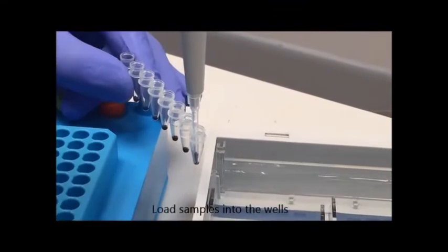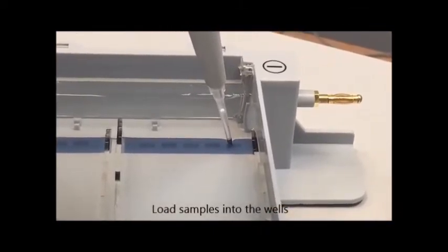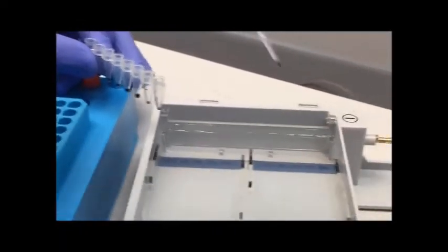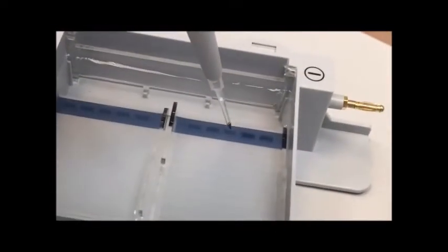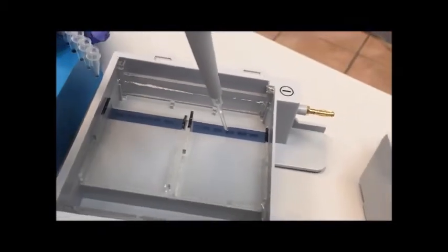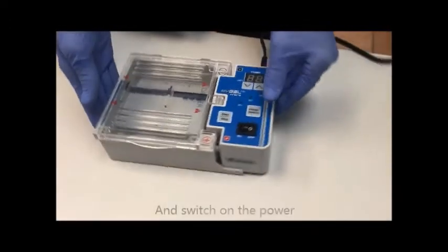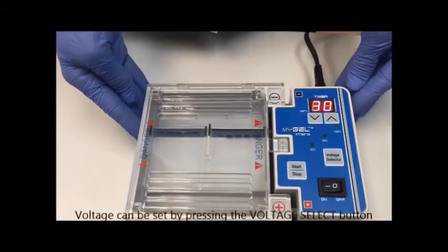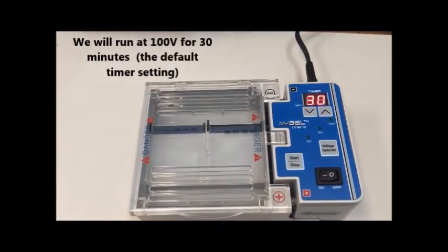Now we pipette our samples into the gel wells. After the samples are loaded, connect the power cord to the back of the power supply and switch on the power. The voltage can be set by pressing the voltage select button on the MiGel power supply. We are going to run the gel at 100 volts for 30 minutes.